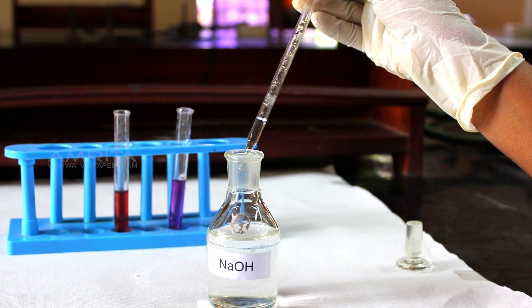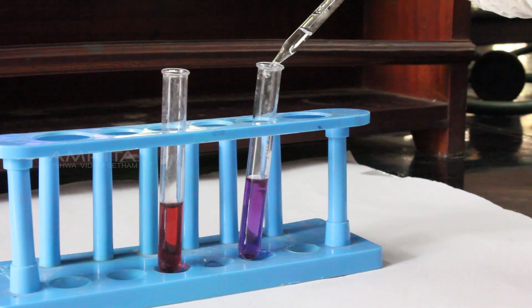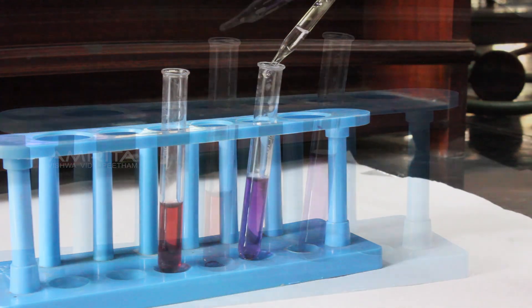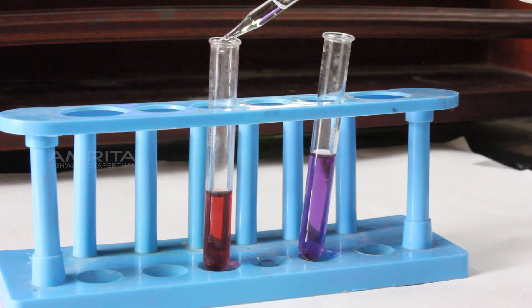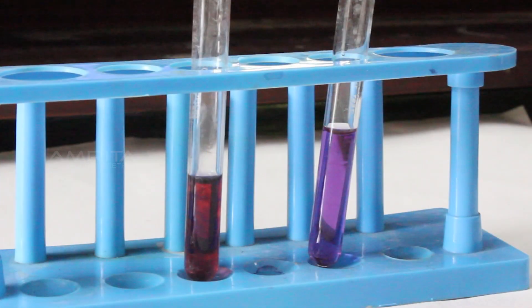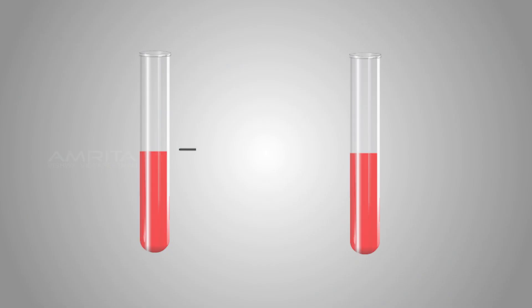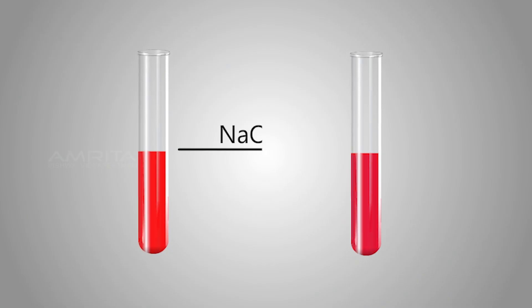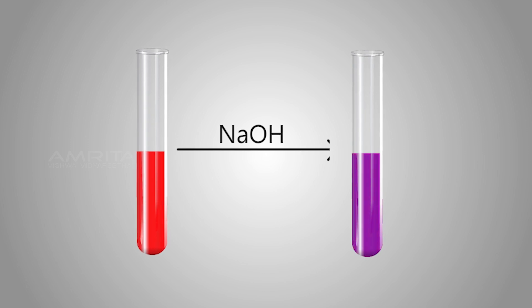Similarly, add a few drops of NaOH to red litmus solution and blue litmus solution, which are taken separately in two other test tubes. You can see that red litmus solution changes to blue, which indicates that NaOH is an alkali, having pH more than 7.